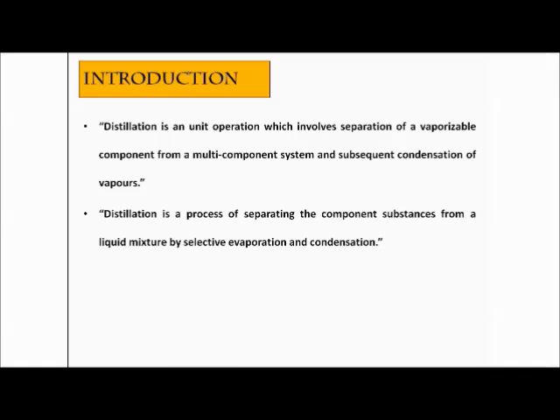Moreover, distillation can also be defined as a process of separating the component substances from a liquid mixture. As I have already told you, we have a mixture, suppose liquid X, which is composed of liquid A, liquid B, liquid C and liquid D. Now if we want to separate these from each other, we separate the component substances from a liquid mixture by selective evaporation and condensation. So what do we mean by selective evaporation and condensation?